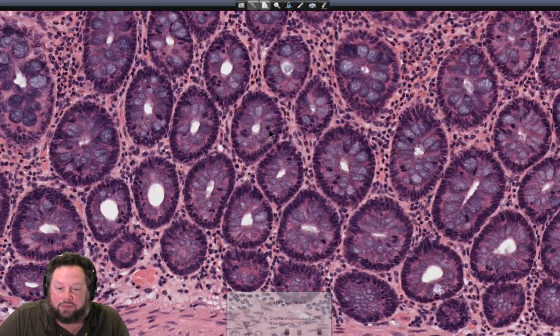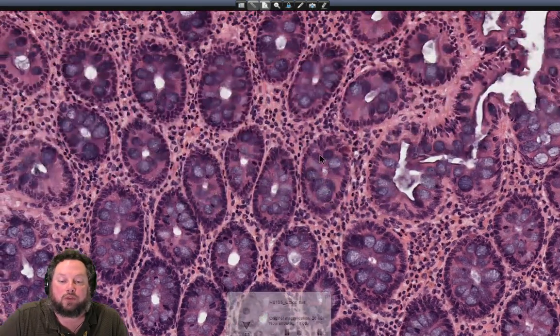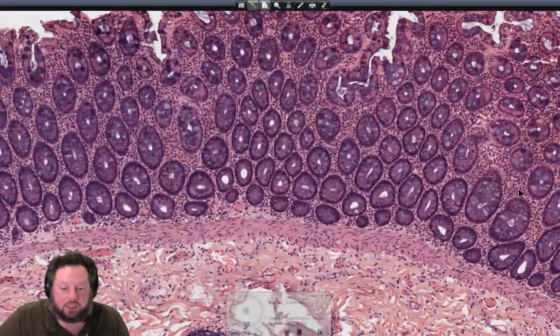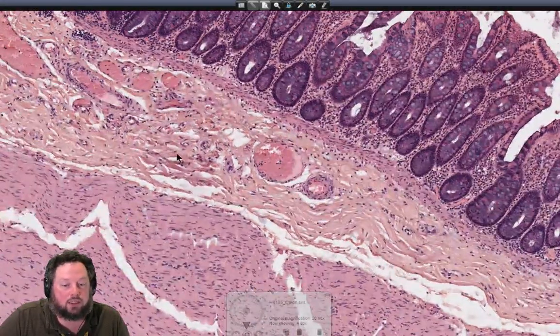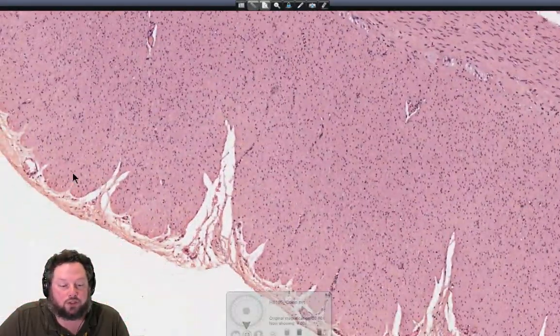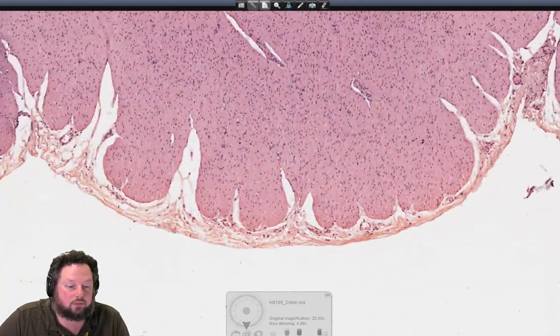Again, we get these mitotic figures at the base, where these cells are undergoing mitosis, and they're either forming enterocytes, which are absorbing water, or goblet cells, or enteroendocrine cells. Those are the main cell types that we find in the large intestine glands. Here again, we've got a muscularis mucosae, we've got our submucosa, we've got our muscularis inner circular, outer longitudinal, and this region has a serosa. We've got this flattened surface here.